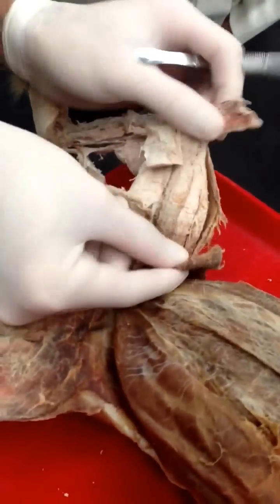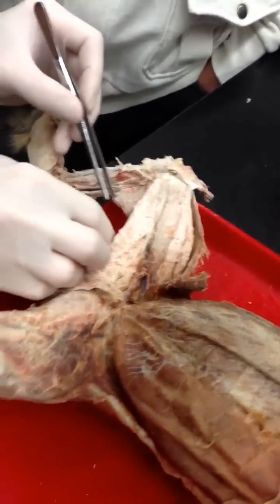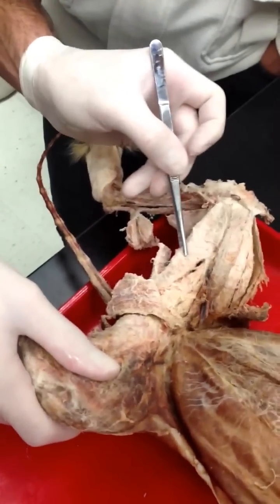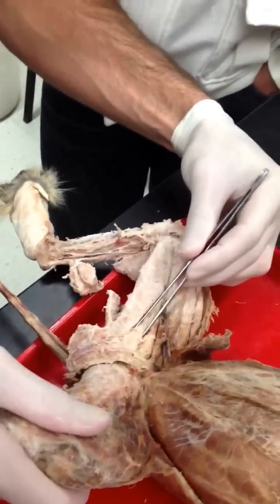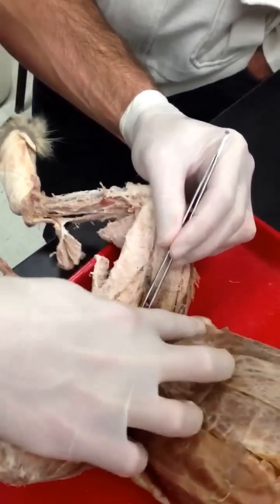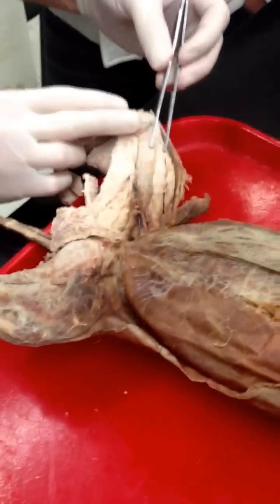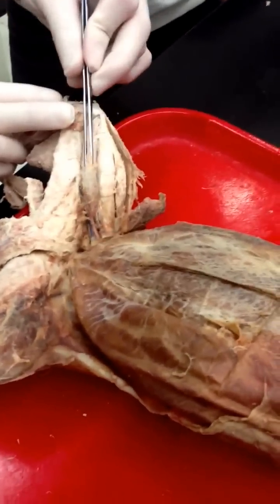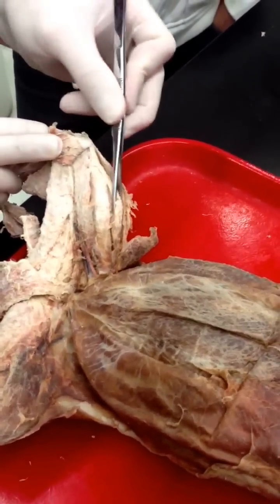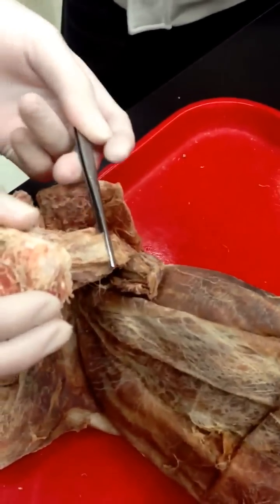Sartorius, semitendinosus, semimembranosus, adductor femoris, adductor longus, pectineus, vastus medialis, rectus femoris, vastus lateralis. Iliotibial band — or IT band — lateral to the vastus lateralis.